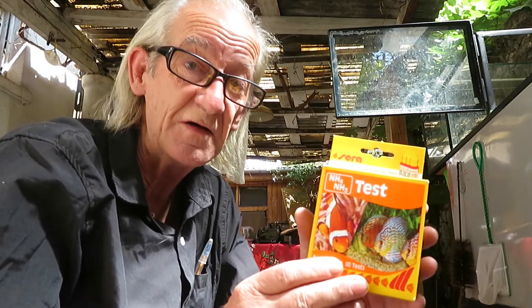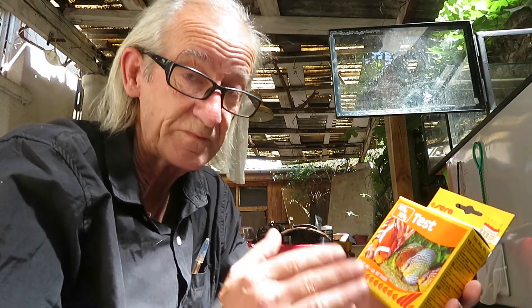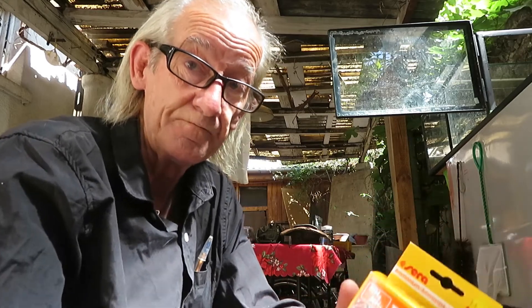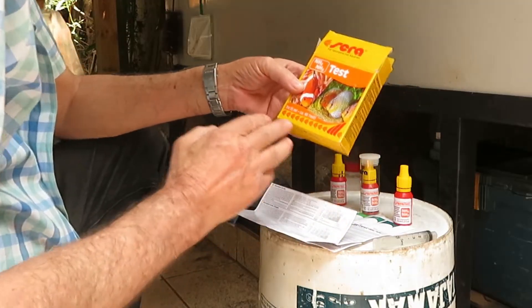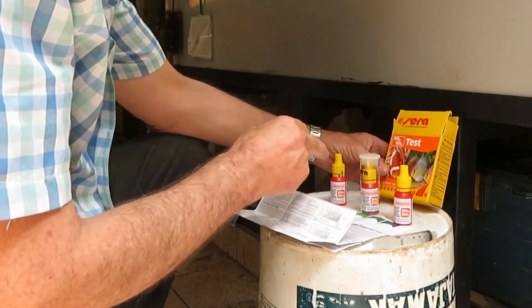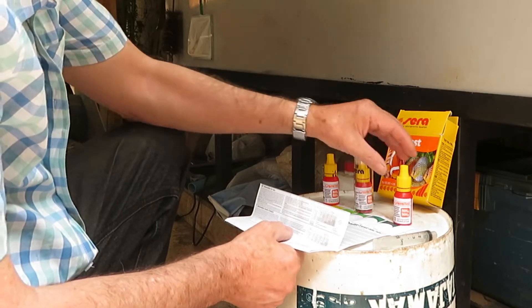This is a kit by Sara. It's very inexpensive and it allows you 60 tests of your aquarium water. This kit comes with three bottles with reagents: bottle 1, bottle 2, and bottle 3.